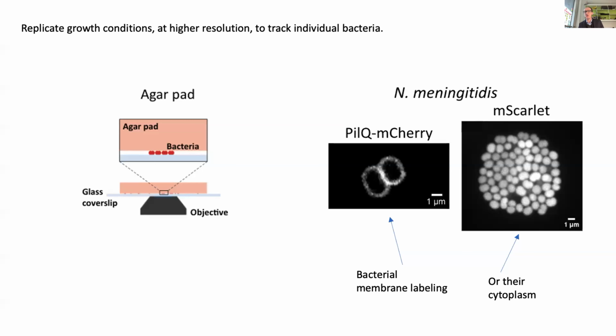And we wanted to study that, right? How these single bacteria grow and they can maintain this huge pressure. We don't do that on humans. We have an experimental setup in which we can replicate the growth conditions, and have them in something which is amenable to microscopy.